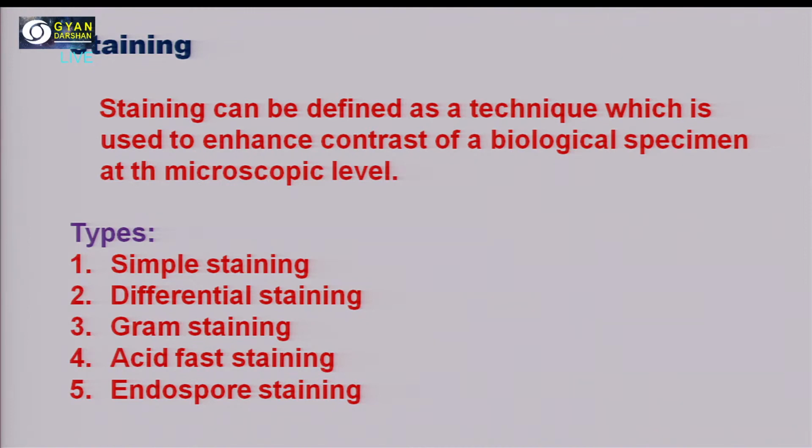Now, this staining procedure can be of different categories. It can be simple staining, differential staining, gram staining, acid-fast staining, or endospore staining. Today we will be chiefly discussing the first three techniques, that is simple staining, differential staining, and gram staining.